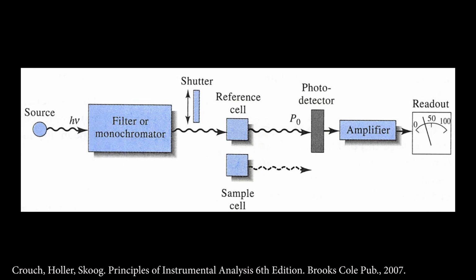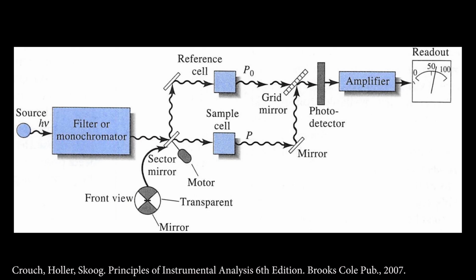And then you pull that cuvette with just a solvent in it out. And then you replace it with the sample cuvette. Or you can clean that one cuvette and put the sample in it. And then you put it in. And then it sees how much the transmittance goes down, how much light was absorbed, how much less light was transmitted at each wavelength. And that is what it is plotting in the spectrum.